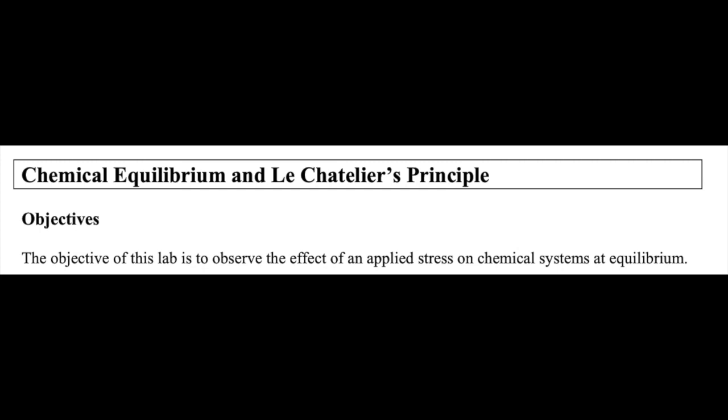This lab consists of 5 different parts. Each part starts with a reaction at equilibrium and introduces some kind of stress to the reaction. Your goal is to observe how the reaction responds to the stress.